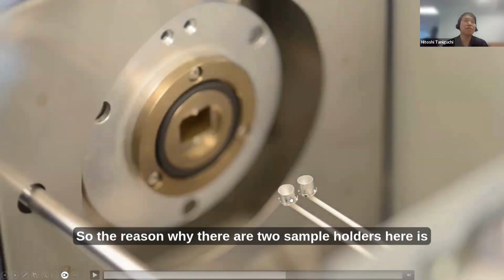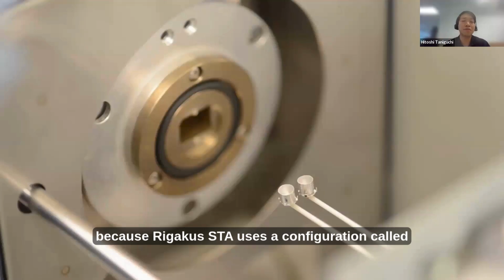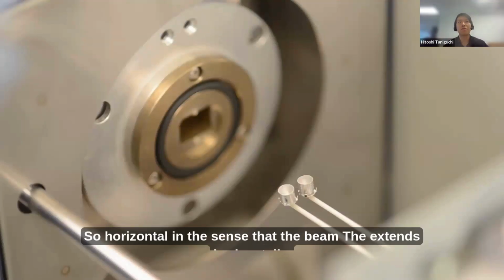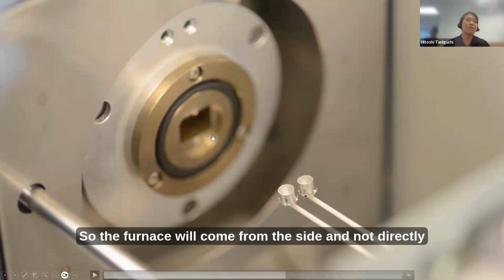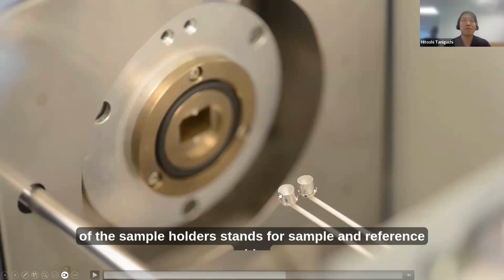The reason there are two sample holders here is because Rigaku's STA uses a configuration called horizontal differential STA. Horizontal in the sense that the beam extends horizontally, so the furnace will come from the side and not directly from above. And it's differential in the sense that each of the sample holders stands for the sample and reference side.